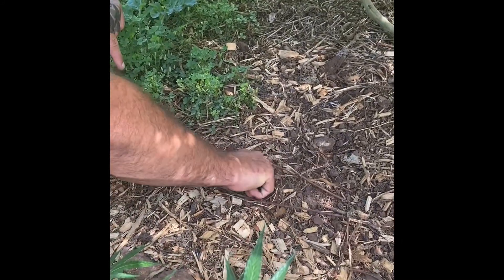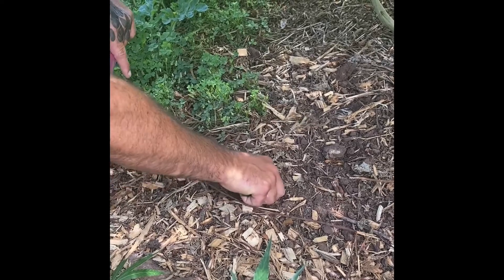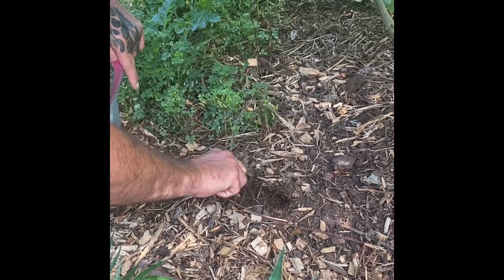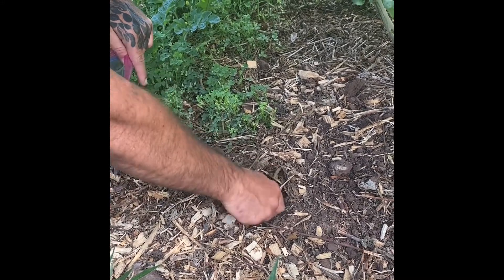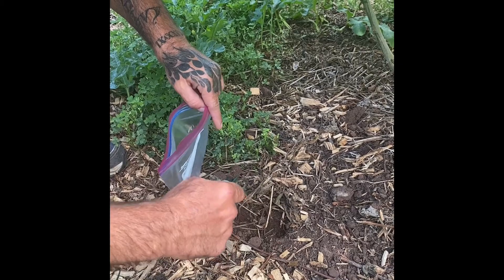Dig in there nice and good, two to five inches down. He's using a clean tool — you don't want to use your hands because they've got microbes on them. We need at least one milliliter of soil, so we'll do a couple of scoops.